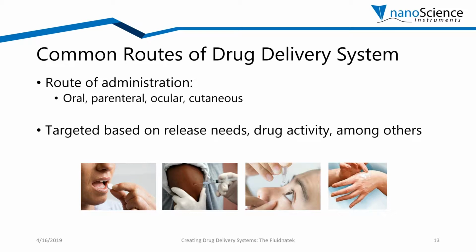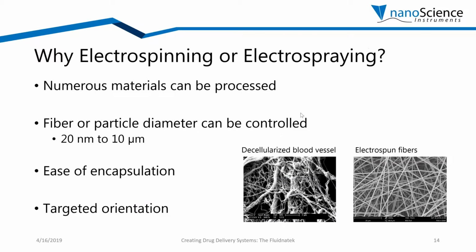In this presentation, we will focus on the electrospinning and electrospraying techniques and how they are used to create drug delivery vehicles, specifically with the Fluidnatek technology. But why use electrospinning or electrospraying? One of the main keys is that a wide variety of materials can be used.